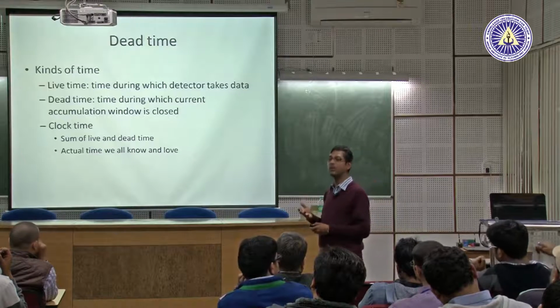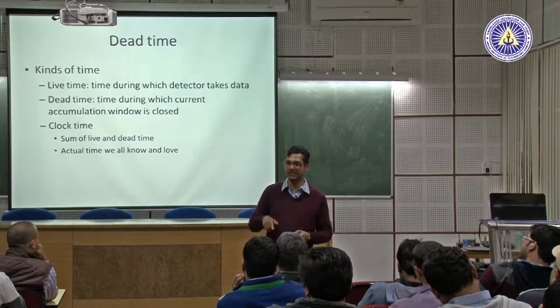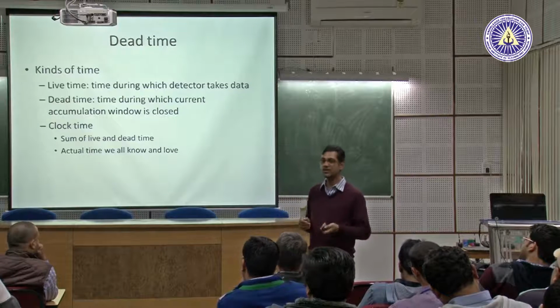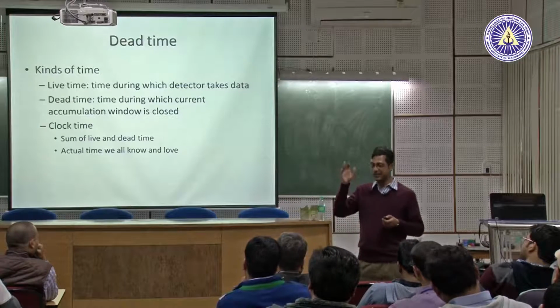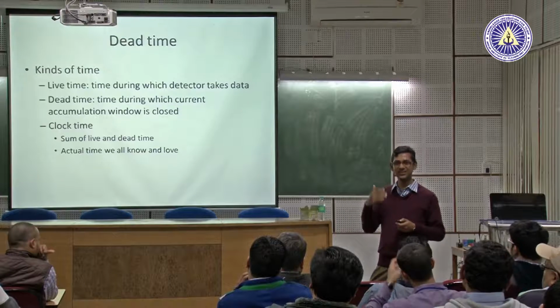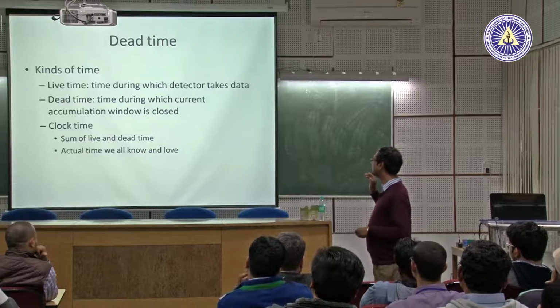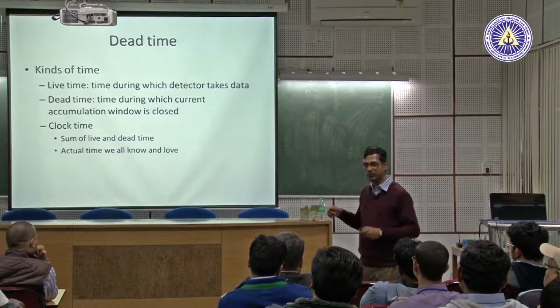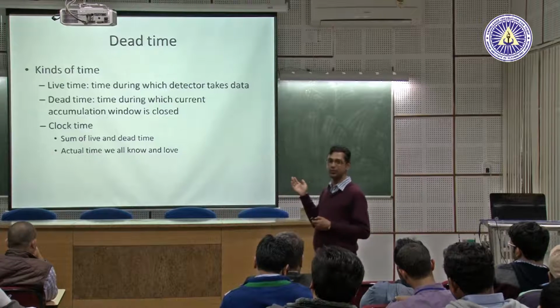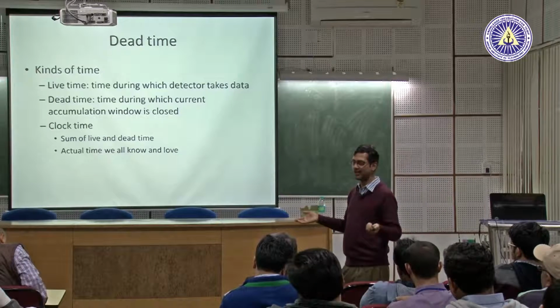But it creates a problem, because you have a liquid nitrogen layer and the Dewar flask, and the X-ray has to penetrate that distance, then you lose information. So nowadays we have liquid nitrogen free detectors, where it is no longer SiLi technology, it's a different technology. So there you don't need that. If you are feeding information at a faster rate, the detector cannot process, and any information going to the detector at that time will be useless.